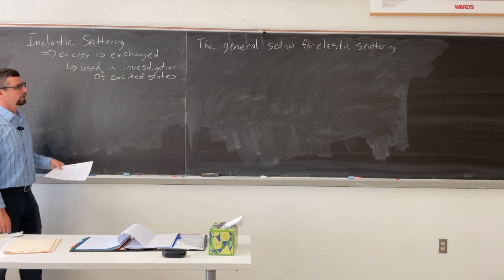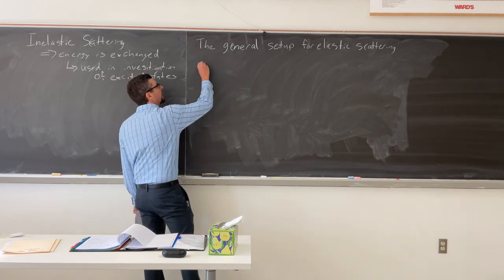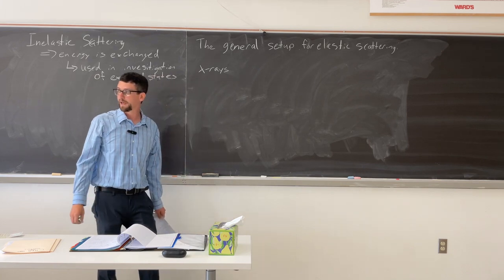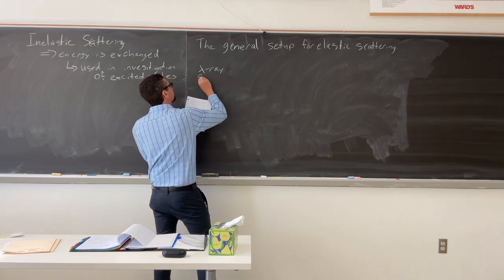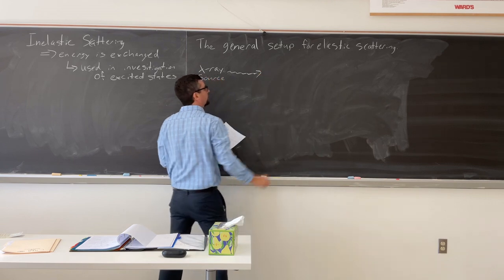Okay, general setup for elastic scattering. We usually have an X-ray source. We use X-rays, and we're going to figure out why we use X-rays through some mathematics in a little bit. So why is that utilized? X-ray source, it goes in.